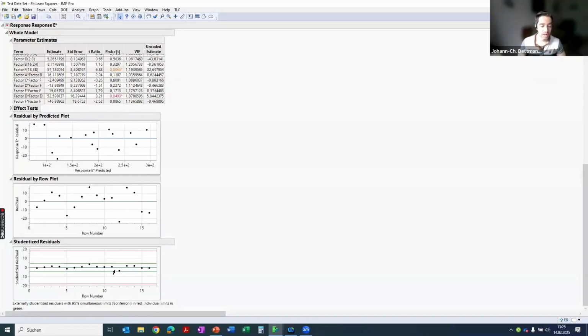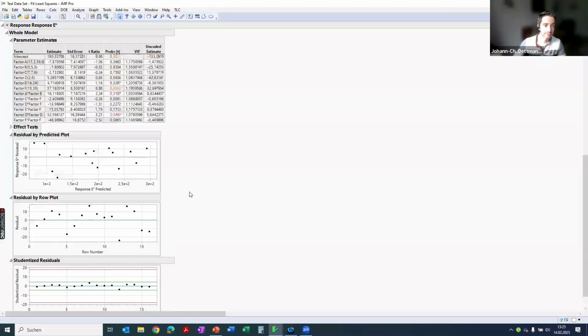When you do not have this in place, you can also consider performing a model comparison, meaning to compare the model with and without the outlier. This comparison should then be supported by an argumentation why the model without the outlier is more representative for your process. But exclusion of data points on a purely statistical basis is not recommended.